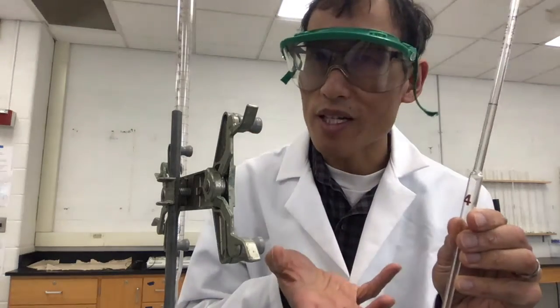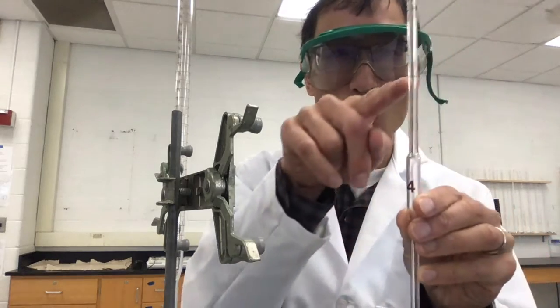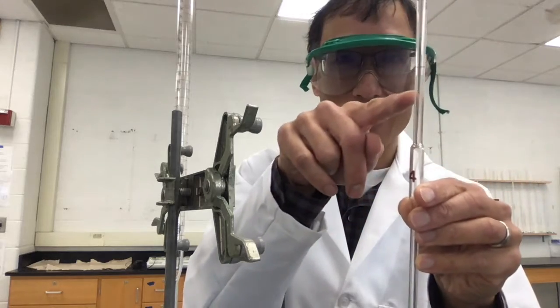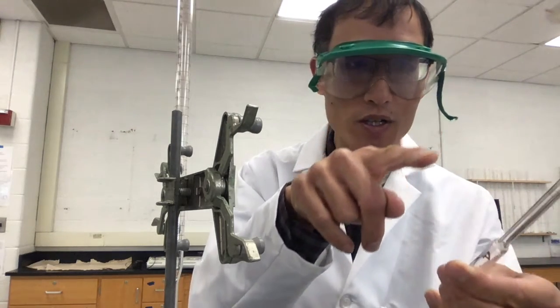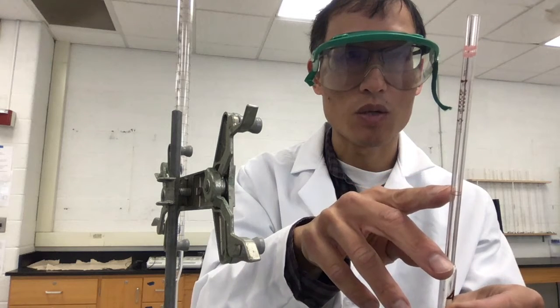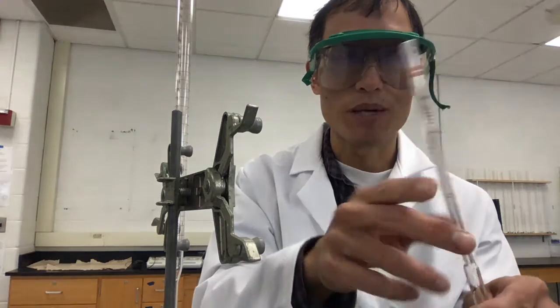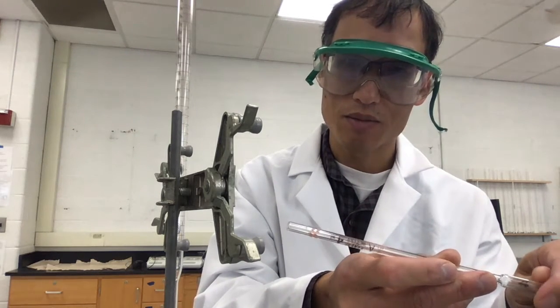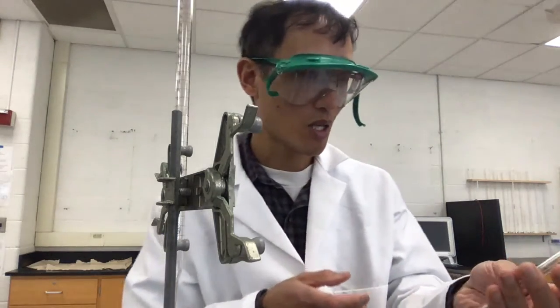That's why we have graduated cylinders, because they have lines on them. This is a volumetric pipette because it's got one line. And that one line tells me that if I draw up exactly to this line, it's exactly 4 milliliters, or 4.0, depending on the accuracy of it. They'll tell you on this one, it doesn't say, I don't know where it is, but 4.00 milliliters, probably.